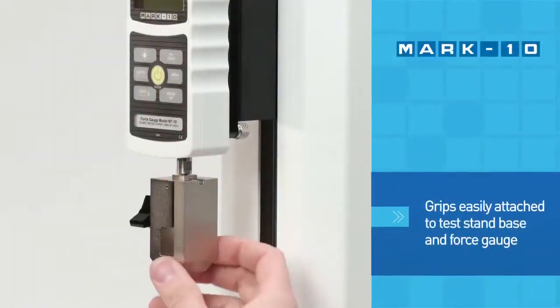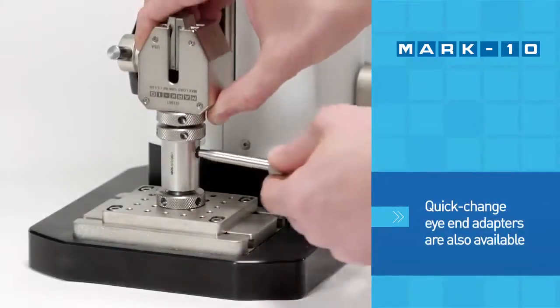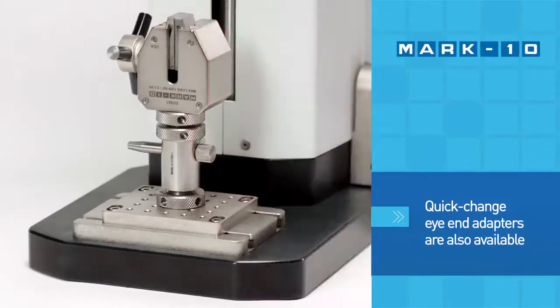Grips can be fastened onto the test stand base and force gauge. Quick-change eye-end adapters are also available to accommodate certain grips and fixtures.